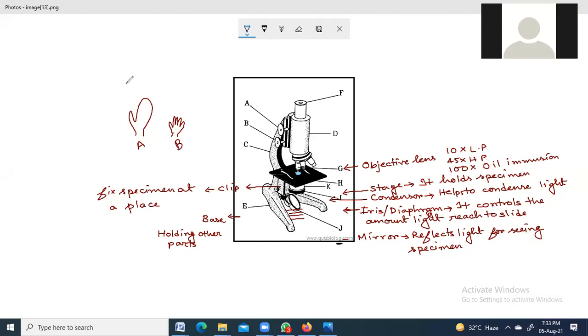So always remember in a microscope, it's not only about magnification. If you see a cell which is blurred, you cannot see the outline, you cannot see the internal parts of the cell. Will that image do? बहुत बड़ा image बना के दिया है वो आपको उसने, but it is not good.